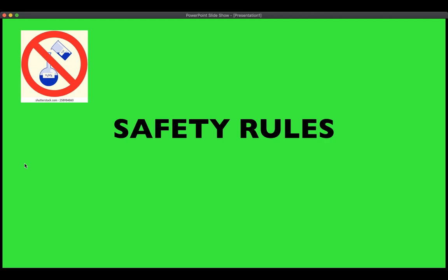Okay, you come in the lab, you leave your baggage, so your bags, your coats, your coffee pots, I don't know what you bring with you. You leave them in the designated area, which I will make sure to tell you when you come to the lab. This is the area where you're going to leave your bags, plus your phones. You can take with you your notebooks and your lab manuals, which you should all have received. In case you haven't, contact me or the professor before the lab, please, so we can give you one. Pens, pencils, calculators, you bring those with you to the benches, okay? You take a seat in one of the benches. It doesn't matter where, just take a seat. Don't make a mess of the entire lab.